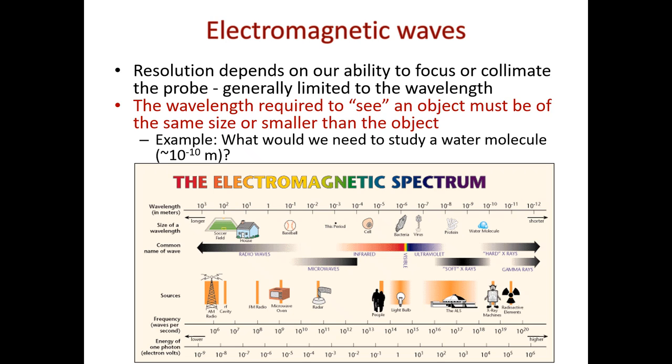So if I look at my X-rays, this is the lab that we visited. They're basically the soft rays, and they're typically a combination. We're going to go into a little bit of detail on that. They're typically polychromatic, so I have a range of X-ray wavelengths that are going through. The ones that are really monochromatic, or really one wavelength of X-ray, are those coming from larger sources than we have here downstairs. So you have to go to national labs for those. Okay. So those are more powerful sources.